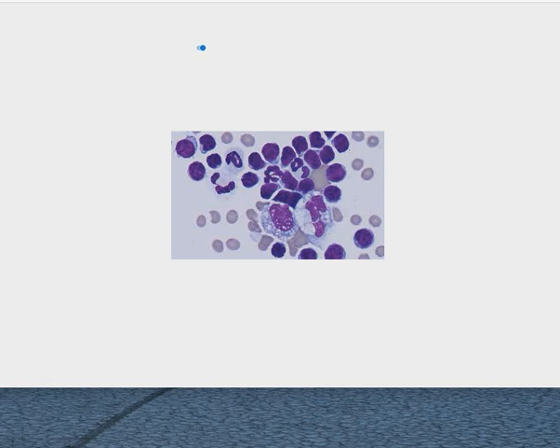The first line of defense, remember, neutrophils. So neutrophils, monocytes, eosinophils, sometimes mast cells or basophils, and sometimes a few lymphocytes. These are the cells of inflammation. And I won't get into this too quickly, but our monocytes, once they leave the peripheral blood, become cleanup machines out in the body, and they turn into really effective cleanup machines, and we call them macrophages. You can see that these guys look a lot like monocytes, but they're pretty revved up to do what they're going to do.